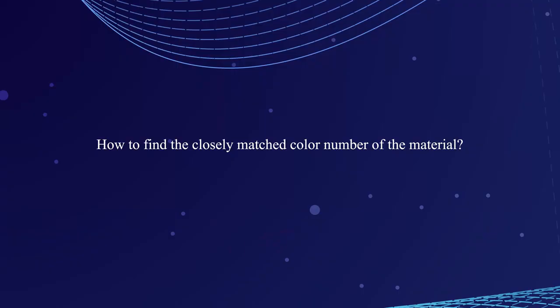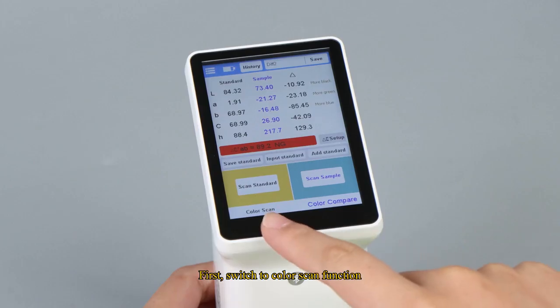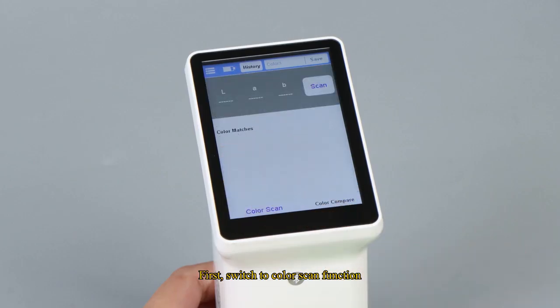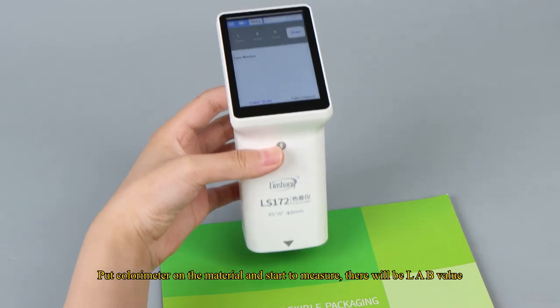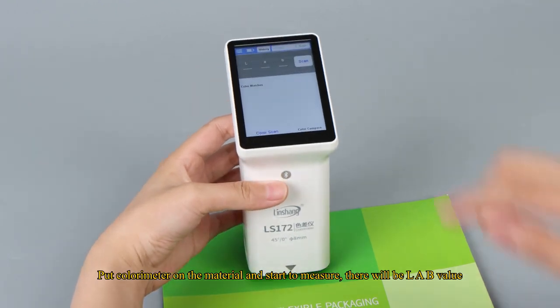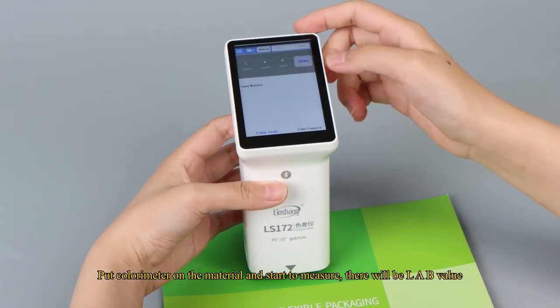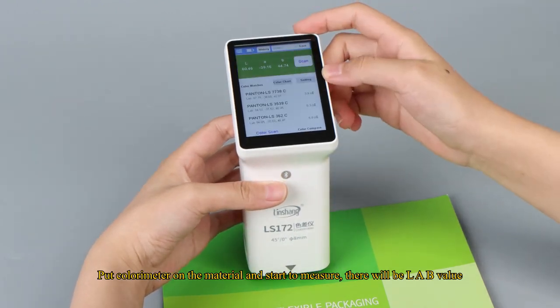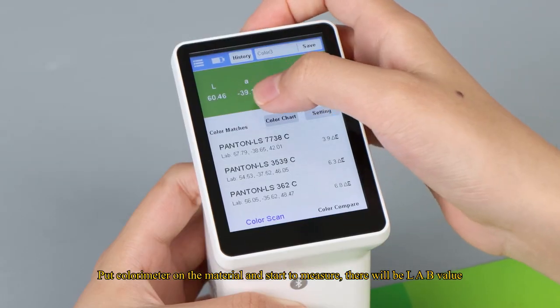How to find the closely matched color number of the material. First, switch to color scan function. Put colorimeter on the material and start to measure. There will be LAB value.